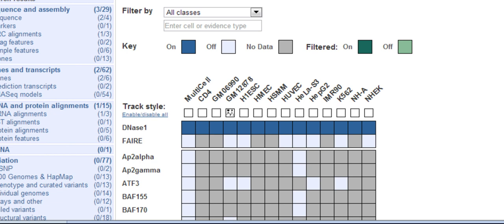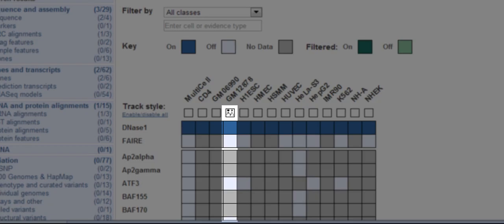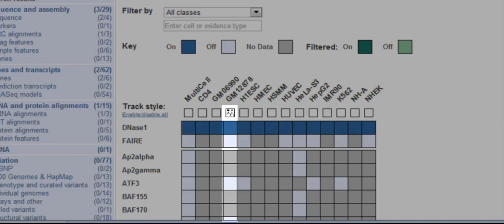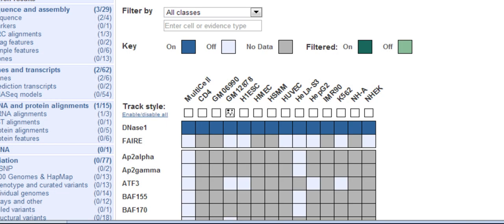If I close the matrix now, I will only see data for the dark blue boxes under GM12878. These will be DNase1 hypersensitivity and CTCF binding sites only.